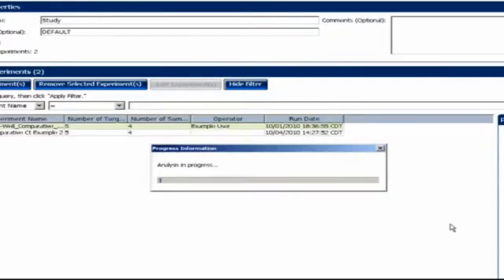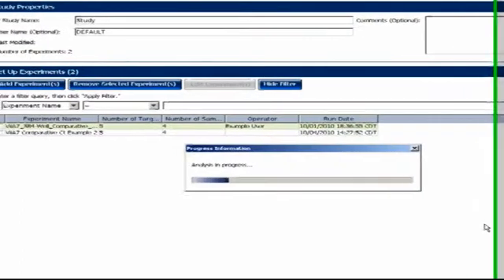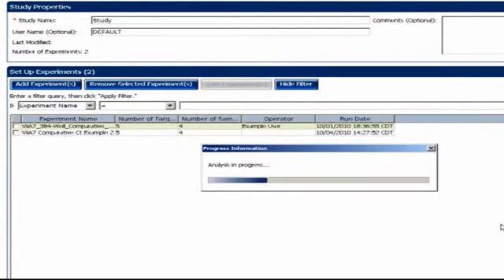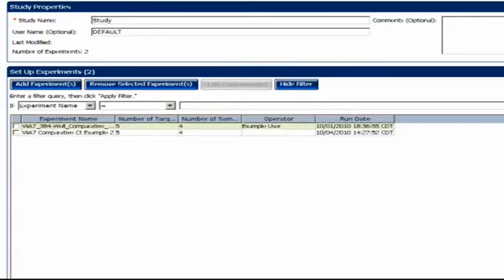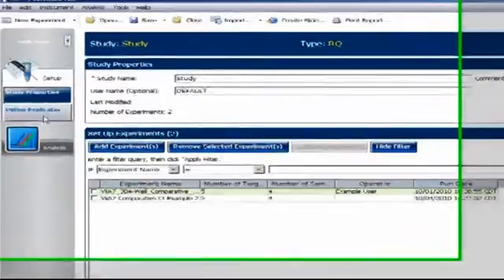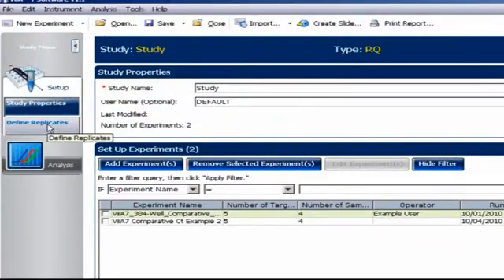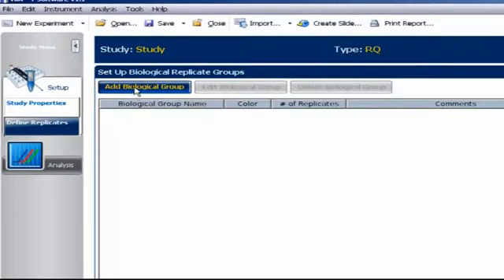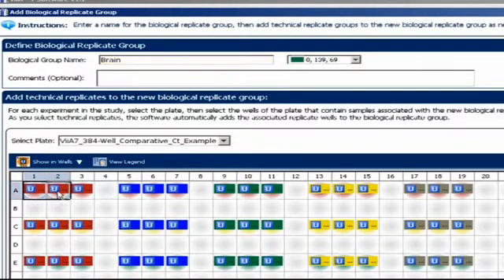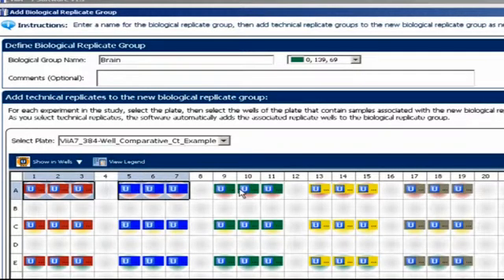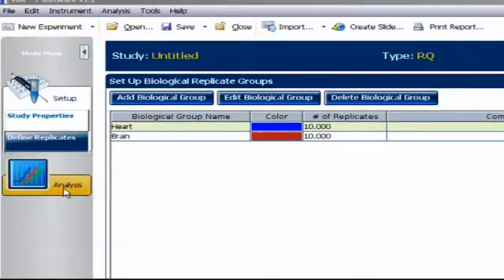If we were using the study itself to perform the final analysis on the data, as in this example study from the ViiA 7, we'd want to go under the Study menu, Define Replicates, and create biological groupings of samples, which we could then assign to specific wells of the plate map.